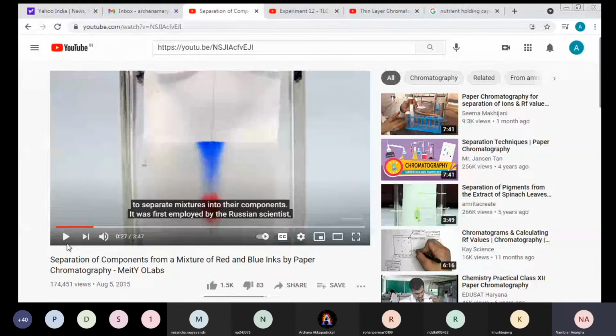So this blue color that you can see is going up in a completely spread-out way. In this case, TLC can also be used once the separation is done. We can also determine the concentration. In TLC you are just going for a separation purpose. However, once we separate it, we can use that material and actually find out the concentration of the sample also. And if this type of separation occurs, then the proper concentration that we need, we will not get because it has spread.